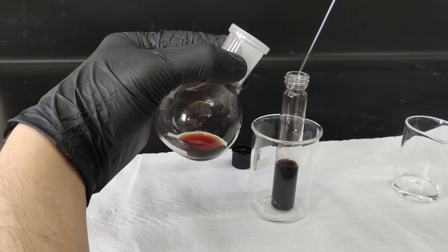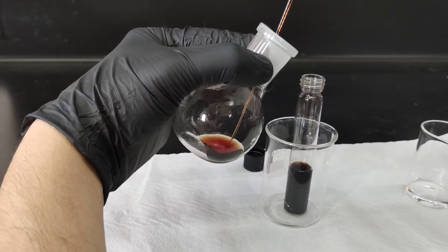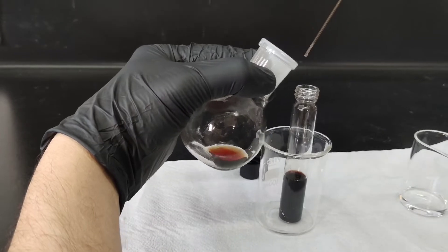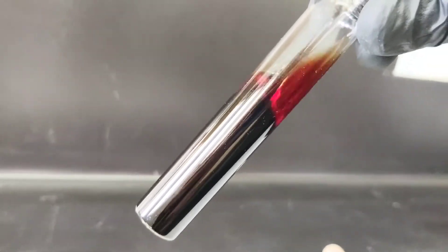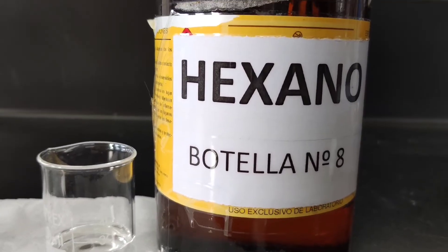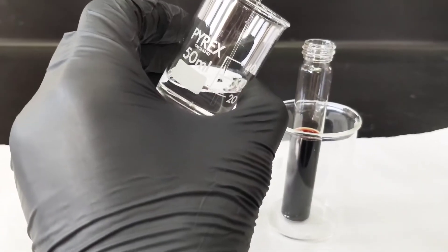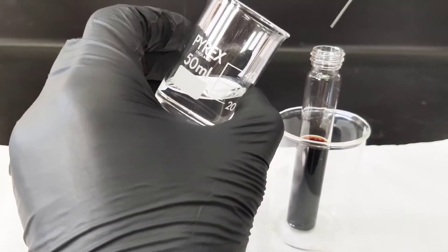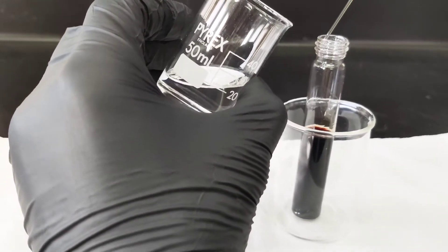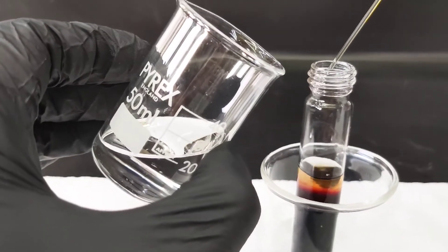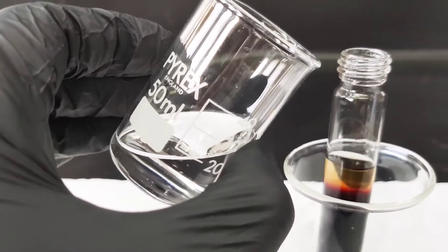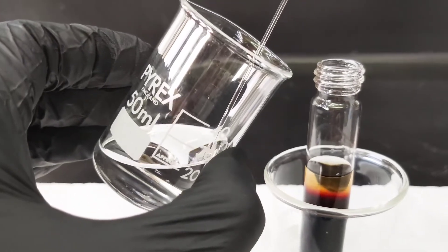We wash the remains of the round bottom flask with more DCM and pour it into the long vial. We mix it and then we add normal hexane slowly and carefully layering on top of the DCM solution. This is a crystallization method called slow diffusion.